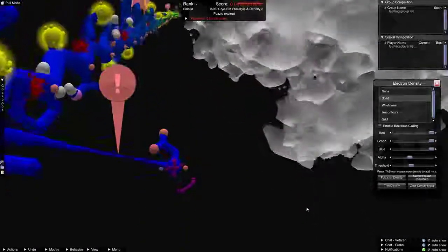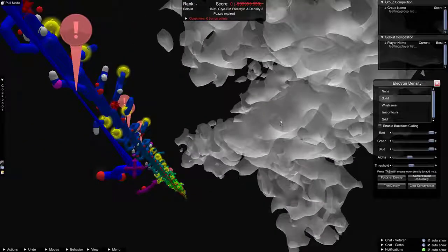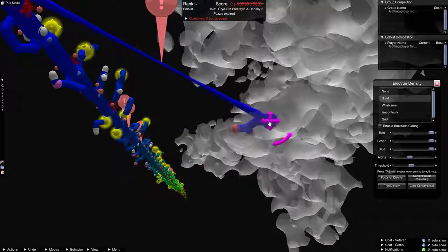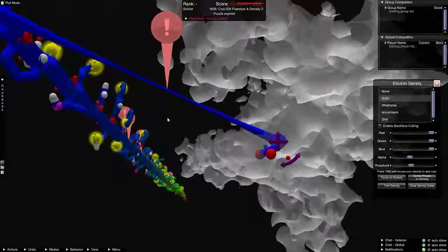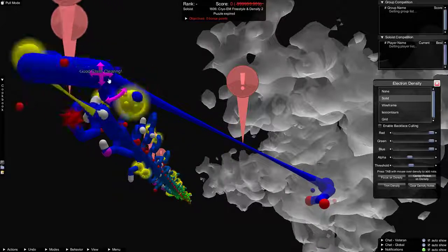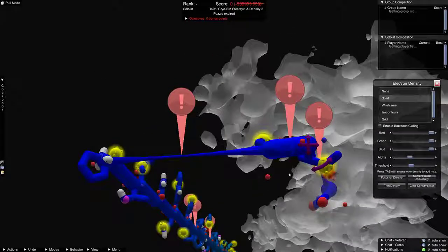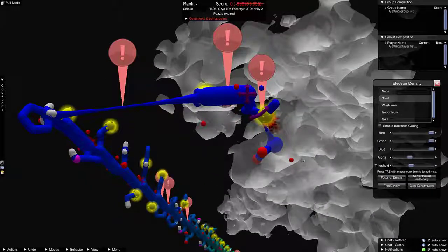So suppose, I know this isn't necessarily the terminal end, but suppose you found the terminal end of the protein here. So I would just drag it over, and then I would move on to the next residue here. Give it a cut. Looks like I'm dragging two, but that's okay. And then just drag things in as you see fit, manipulating the side chains as you go.